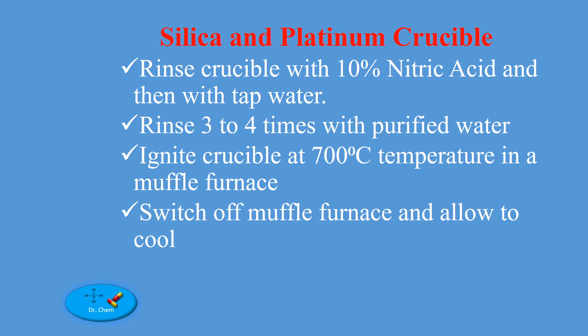Cleanse the crucible at 700 degrees Celsius in a muffle furnace. Switch off the muffle furnace and allow to cool.